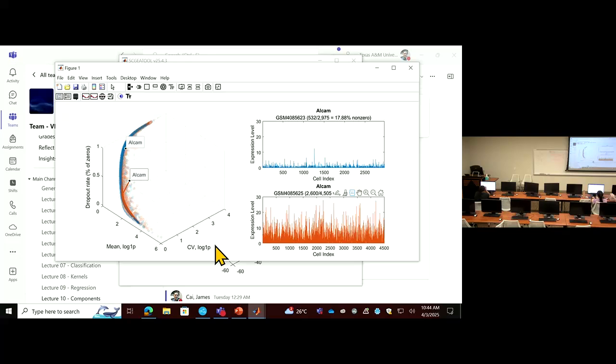Workspace. Then you can start to click on any of the genes. You should find a difference in the two samples. So that's the idea. And the list of genes you can find from this drop down menu. Those top ones, yeah.